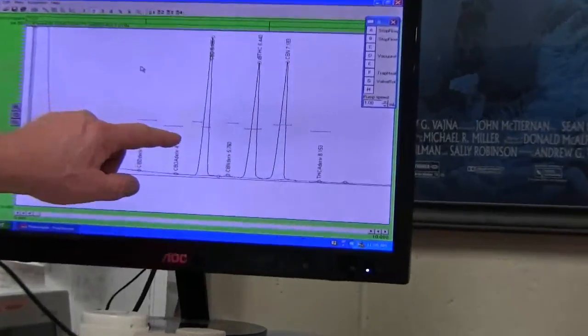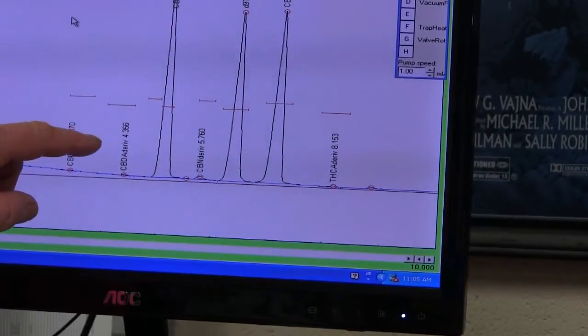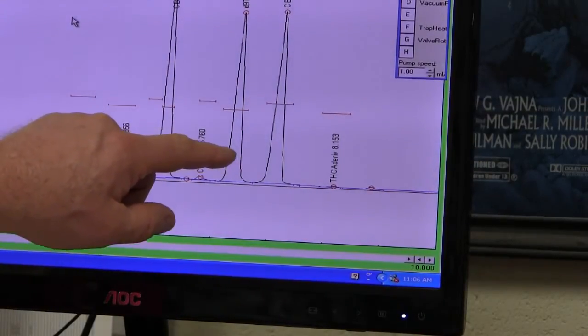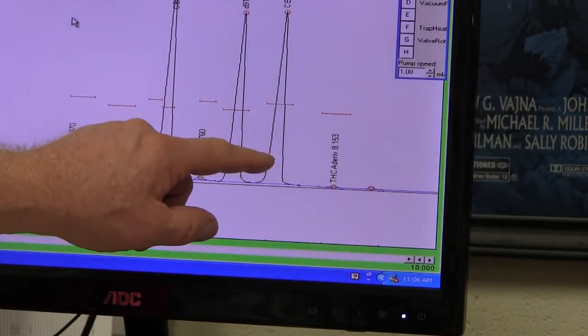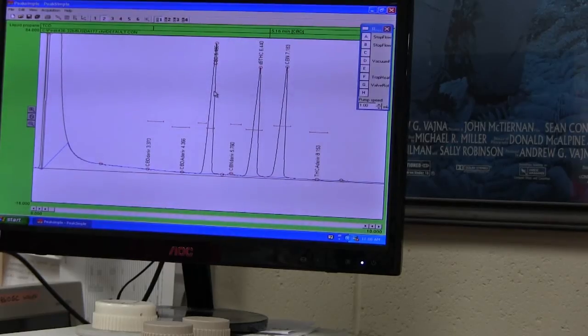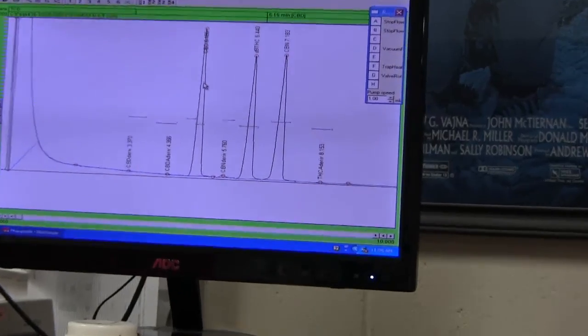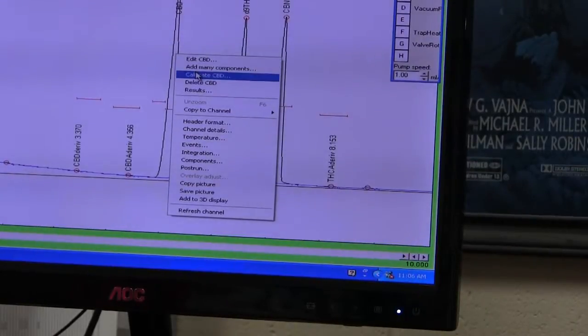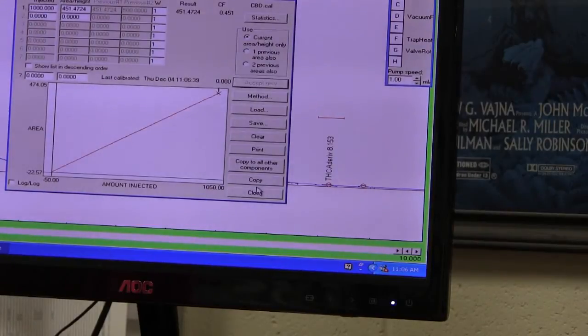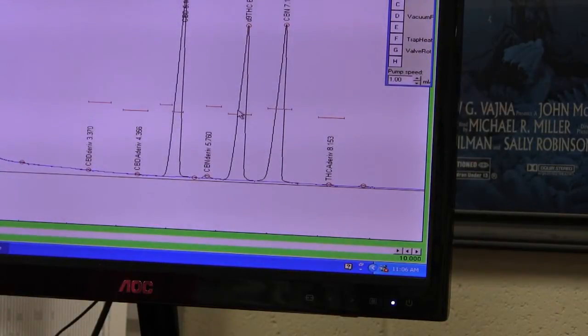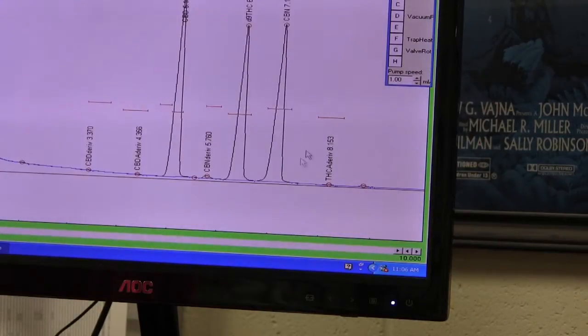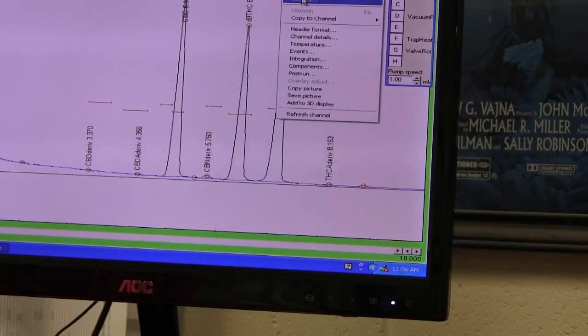So the chromatogram that results from injecting the 3 cannabinoid standard gives us a CBD peak, a delta-9-THC peak, and a CBN peak. So you point to each peak in turn, so I point to the CBD peak and hit calibrate, and then calibrate the CBD peak, calibrate the THC peak, and calibrate the CBN peak.